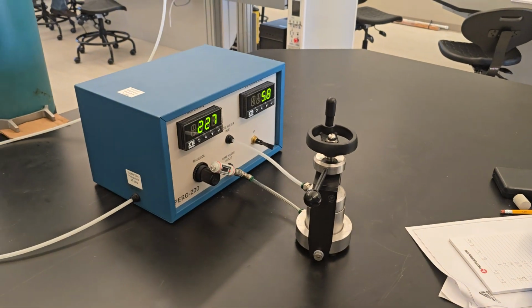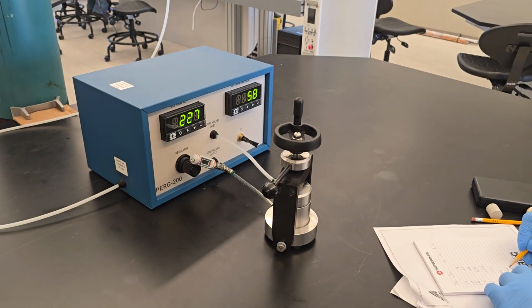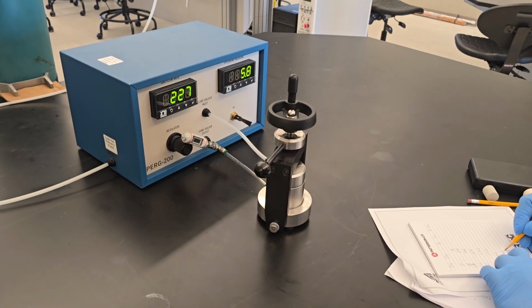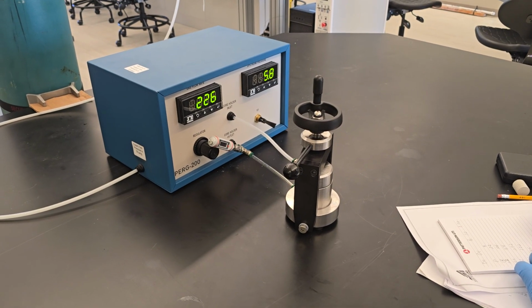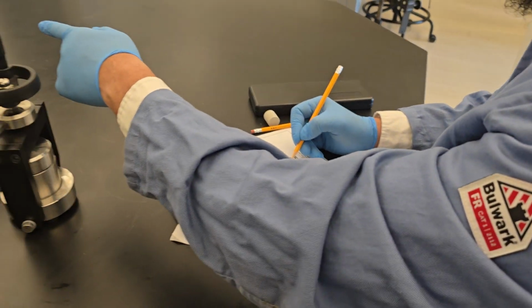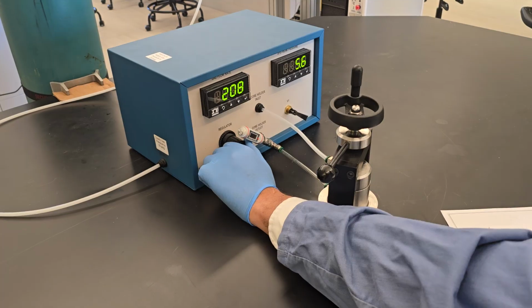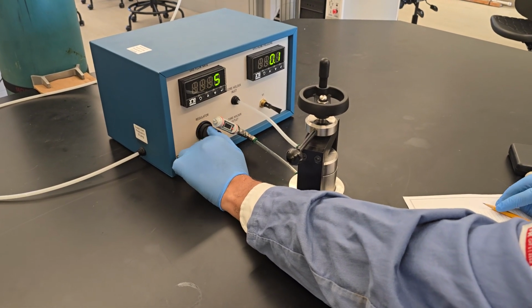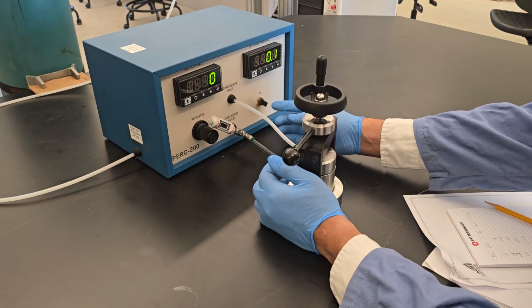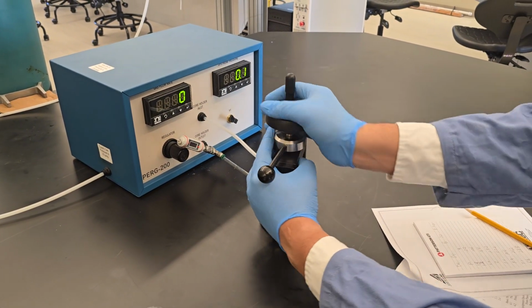227. I always like to stabilize. So 227, 67. So it's fluctuating there. So stabilize it at 227 because 226 made the pressure drop to 5.8. And collect more data at the 4, at the 3. And once I'm done, I'll open the regulator all the way to deplete all the gas, then close this valve and take off my sample.